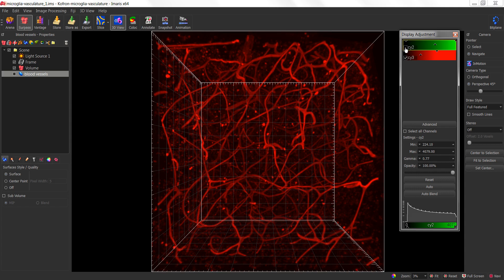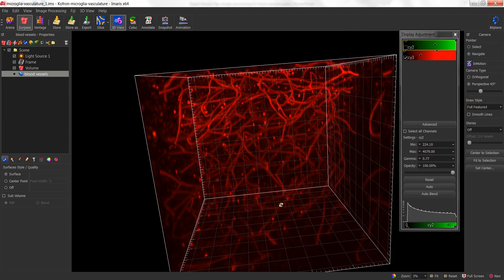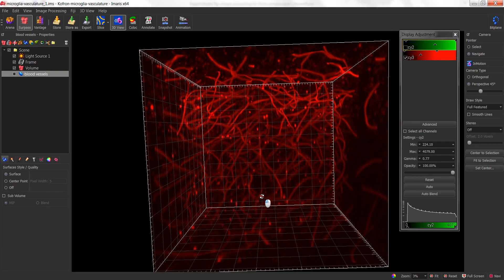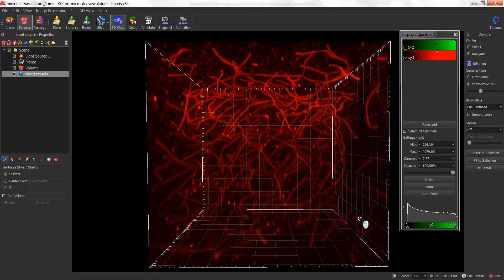When I turn that channel off, you'll notice there is a significant amount of background in this blood vasculature. There's also a significant amount of attenuation. You'll notice that the blood vessels at the top of this data set are significantly brighter than those at the bottom. In order to perform an attenuation correction, I need to have an idea of what the intensity values are for the top of the stack versus the bottom of the stack.